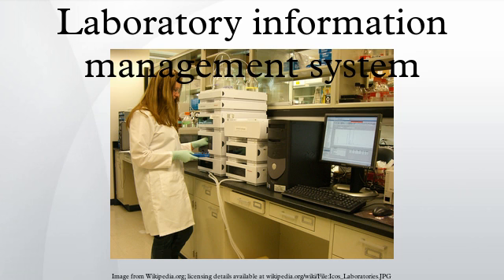Instrument and application integration. Modern LIMS offer an increasing amount of integration with laboratory instruments and applications. A LIMS may create control files that are fed into the instrument and direct its operation on some physical item such as a sample tube or sample plate. The LIMS may then import instrument results files to extract data for quality control assessment of the operation on the sample. Access to the instrument data can sometimes be regulated based on chain of custody assignments or other security features if need be. Modern LIMS products now also allow for the import and management of raw assay data results.